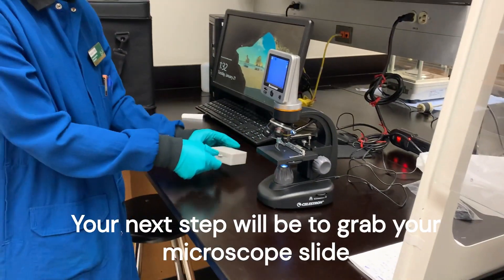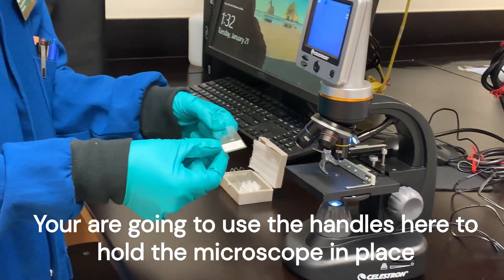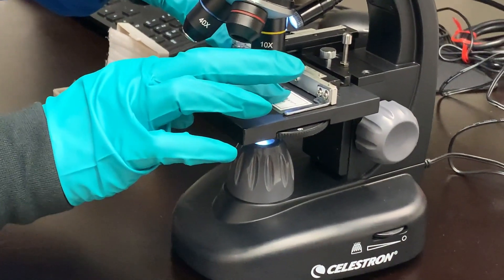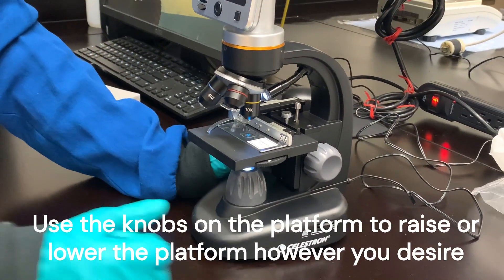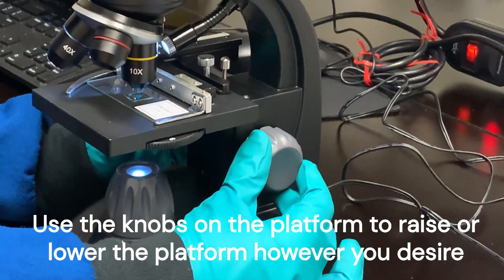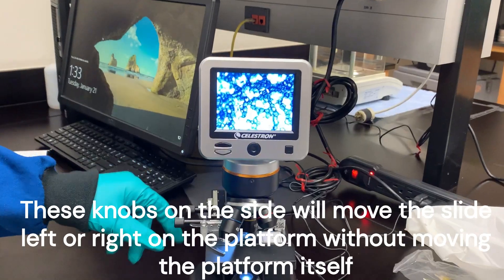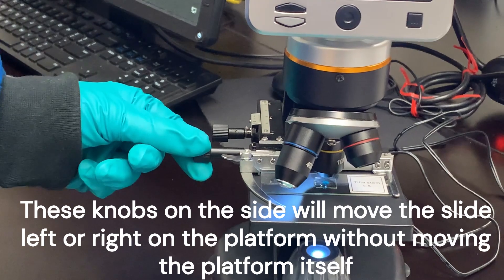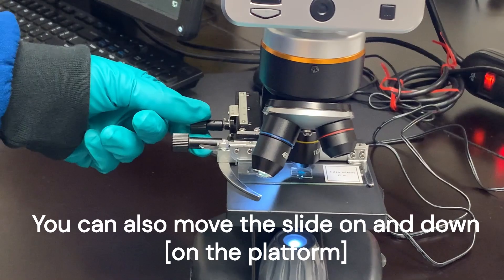Next step will be to grab your microscope slide. Use these handles here to hold your microscope in place. Use these knobs on the side to raise or lower your platform however you desire. These knobs on the side will move the microscope slide left or right on the platform without actually moving the platform itself. You can also move the slide up and down.